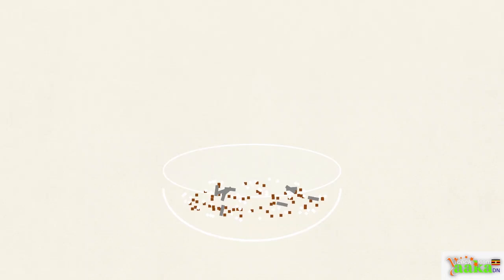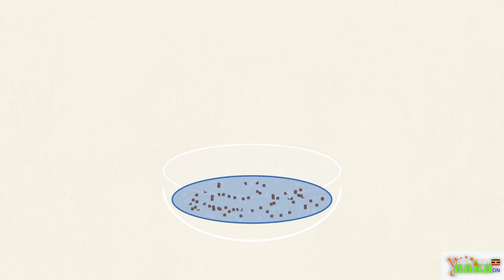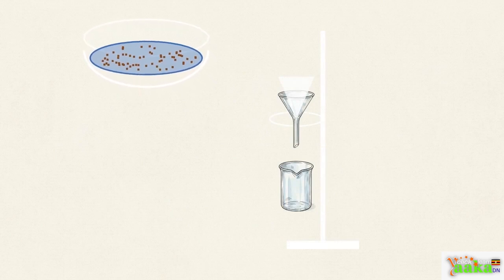To solve this problem without using chemical reactions, we have to exploit the distinct physical properties of each material in a highly specific sequence. We start in the dry state. A magnet extracts the iron nails from the pile, getting them out of the way. Next, we add warm water to exploit solubility. The salt dissolves entirely into the liquid, while the sand remains solid at the bottom.